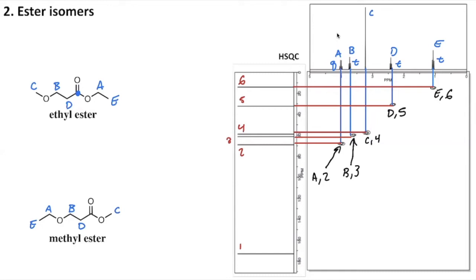When we come to talk about that, think about what's going on here with carbon 1. That is the furthest downfield carbon, but it doesn't seem to have any correlation peaks in our HSQC. Why is that? Thinking about the actual chemical shift, we're somewhere in the 170s. What's the only functional group that gives a carbon that high up in our chemical shift range?